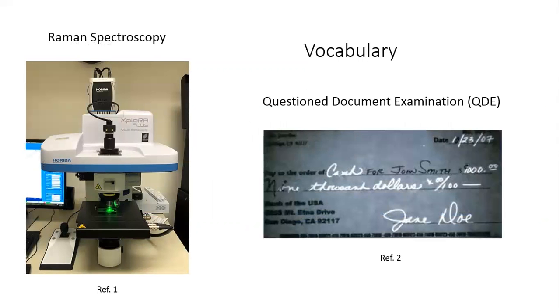My supervisor in this work was Dr. Erica Mishrod, as I mentioned before, and Dr. Mishrod's research interests lie in the field of surface science. A common technique that is being used in her group is Raman spectroscopy. Raman spectroscopy is a non-invasive analytical tool that involves inelastic scattering of light and is used for identifying the chemical structure of compounds of interest.